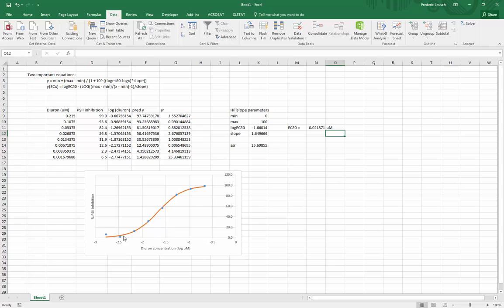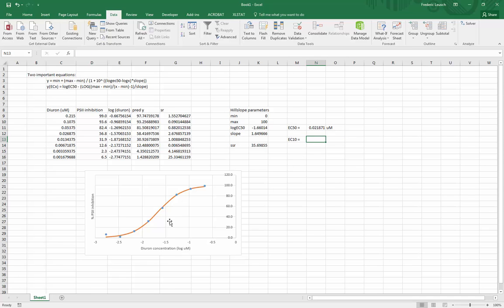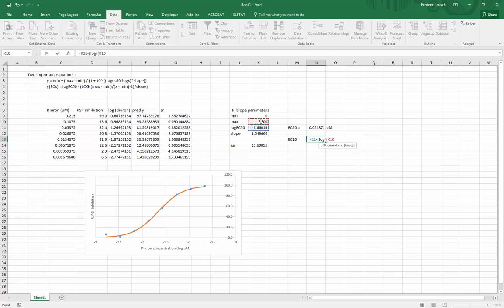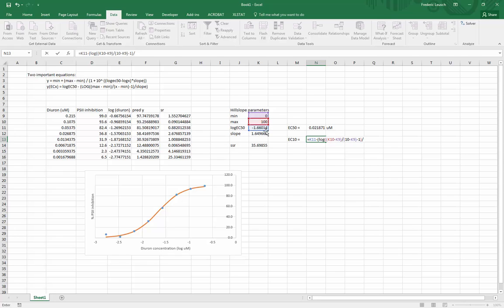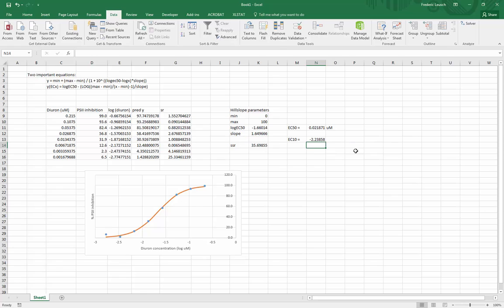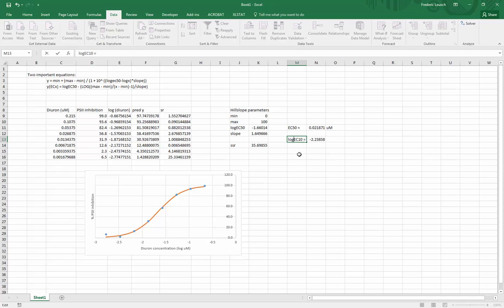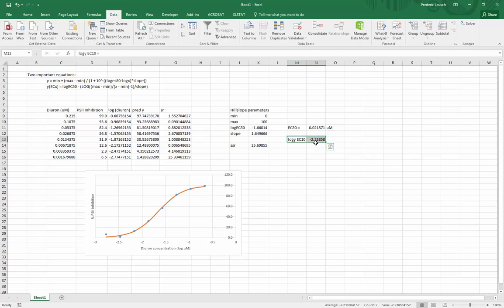Now if you wanted to calculate the EC10 as well you can also do this based on these parameters here, because of course you can extrapolate it from the line. Here's the equation to calculate that. So if I wanted say EC10 I would just using this equation up here: equals log EC50 minus the log of max minus min divided by x, so x being the ECx, so in this case 10, 10 minus min minus 1 divided by the slope. There, so here's my log y value at EC10.